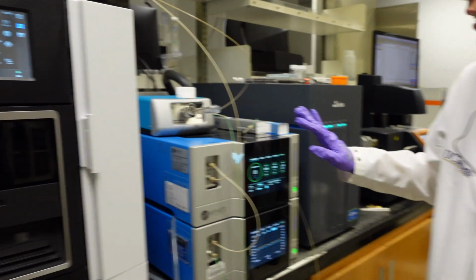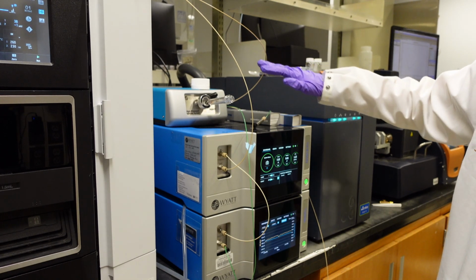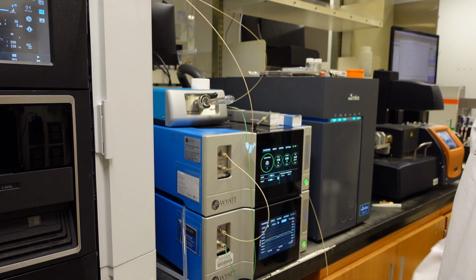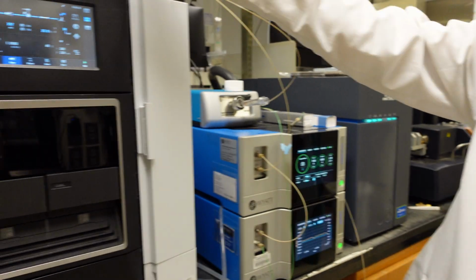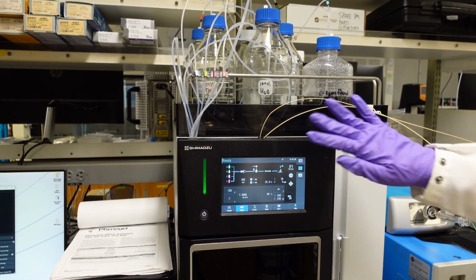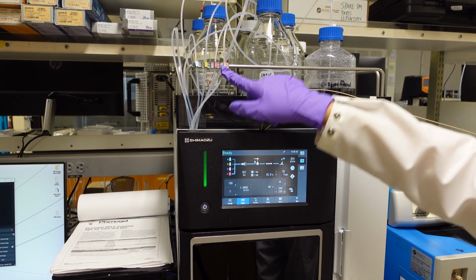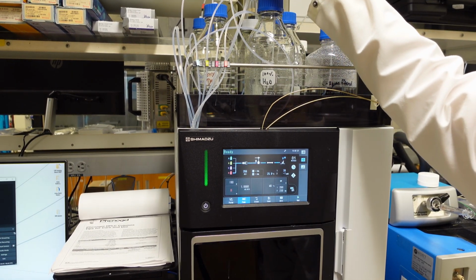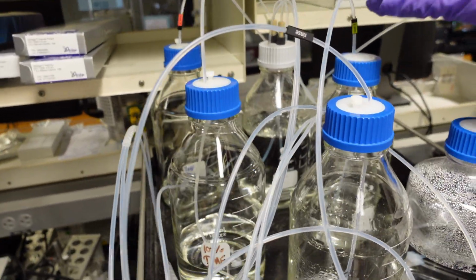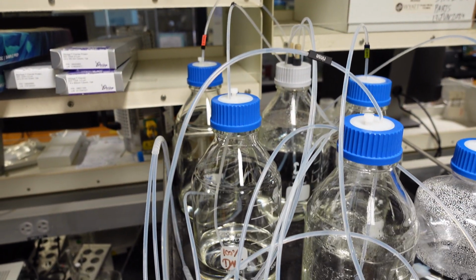Over here, we have our injector. This is our MALS, and this is our DRI. And then over here on top, we have all of our different solvents. They're labeled A, B, C, D. If you flip these over, you can see, this is just rinse, but this one is B, for example. So you can always look and see which one it is. You don't have to trace it through too much.